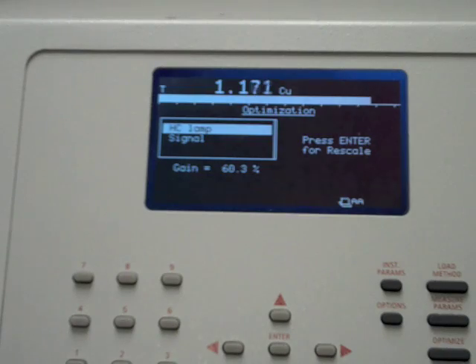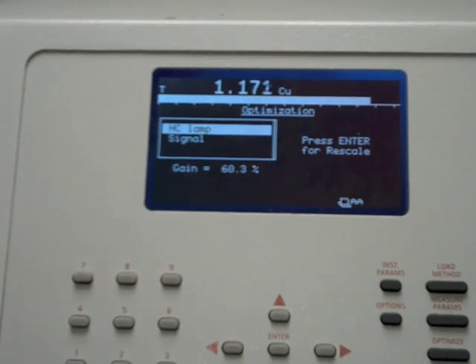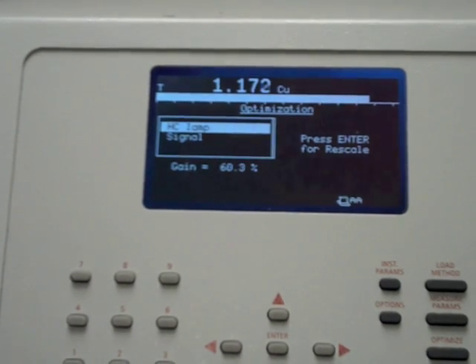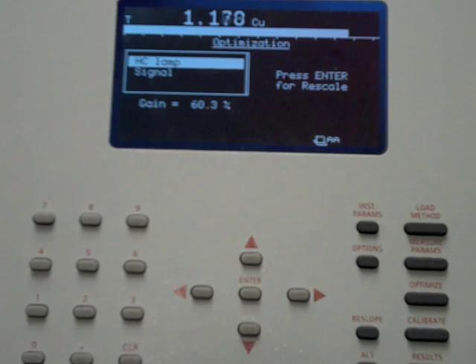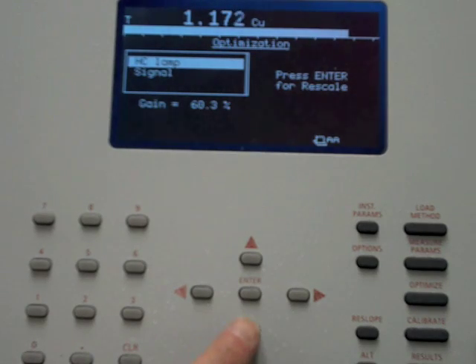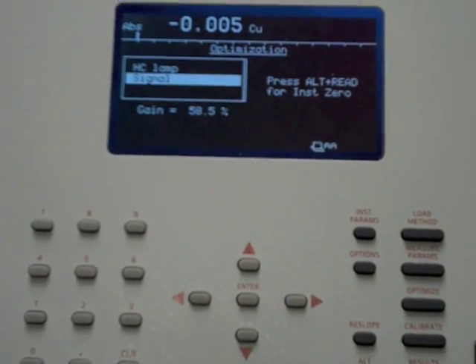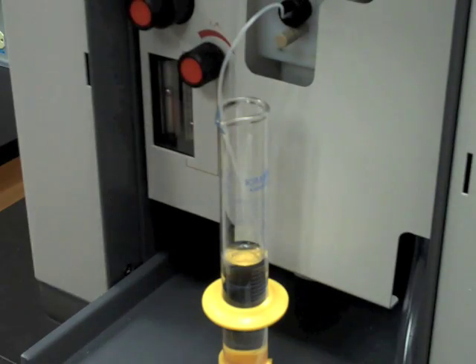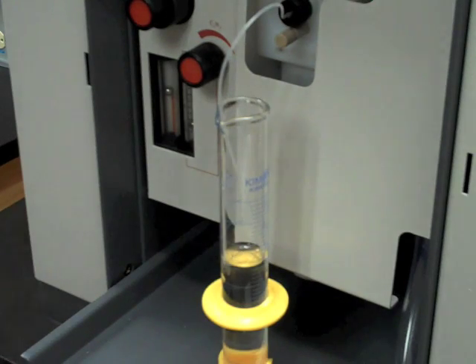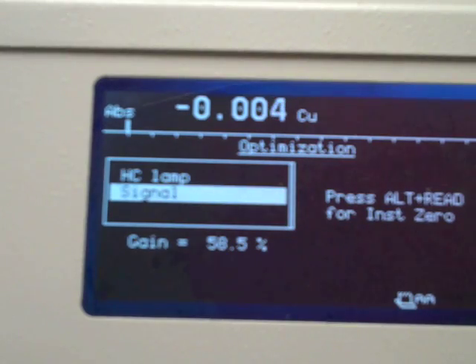At this point, change the detector output to the signal mode using the arrow keys and the enter button. The display will read absorbance. Aspirate deionized water and watch the absorbance reading. If the display does not return to zero, re-zero it by pressing the Alt and Read buttons simultaneously.